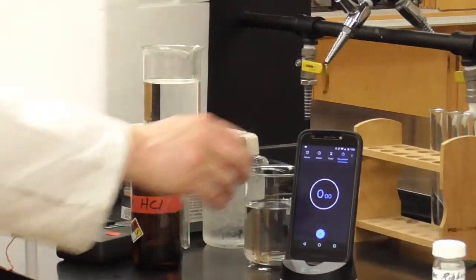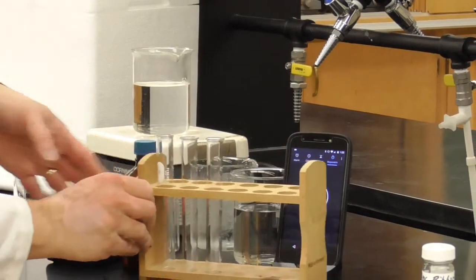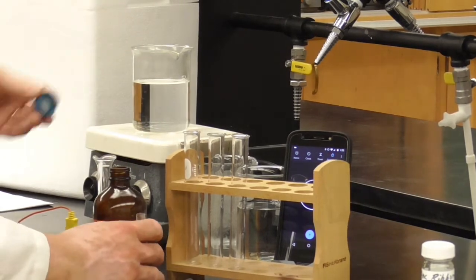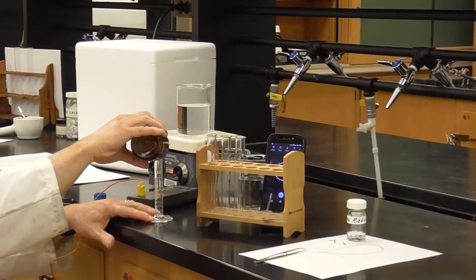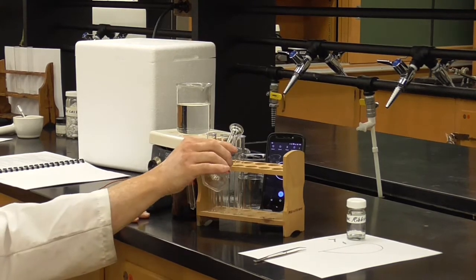First, let's go ahead and put, I'm going to move this up front, let's put 5 milliliters of the hydrochloric acid, 6 molar, in each test tube. So, let's get down here and pour this in. Okay, there's 5 milliliters in one test tube.